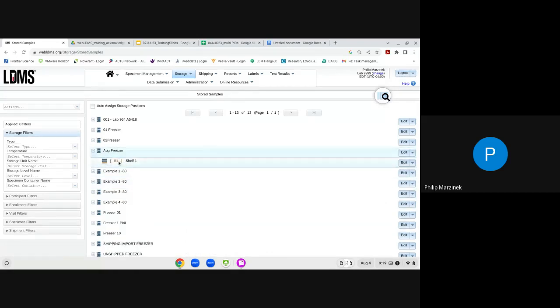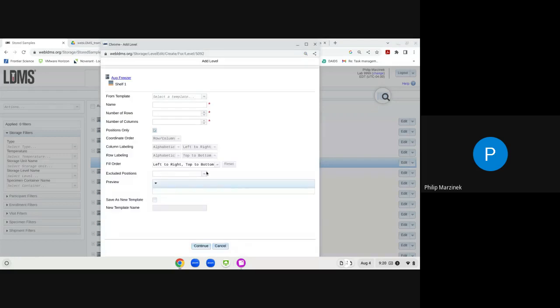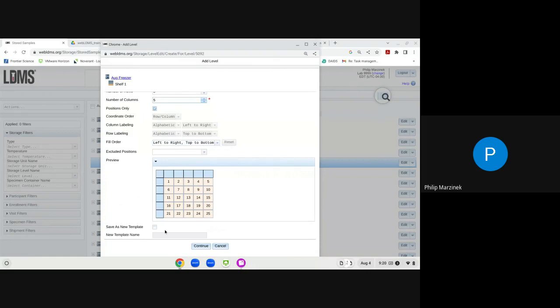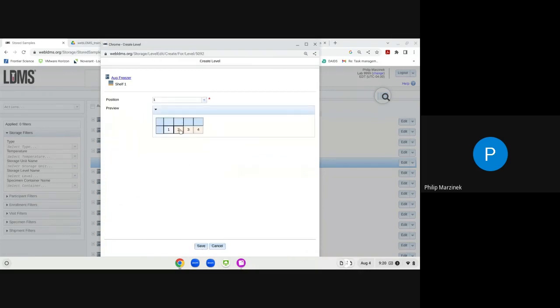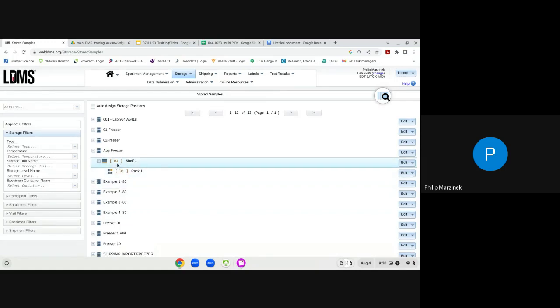With the shelf created in the August Freezer, go to the edit drop-down and click Add New Level again to add a rack. Name it Rack One and configure it as a five-by-five rack holding 25 positions. Click Continue, select position one on the shelf from the drop-down, and click Save. Rack One is now assigned to position one on Shelf One, which is in position one in the freezer.